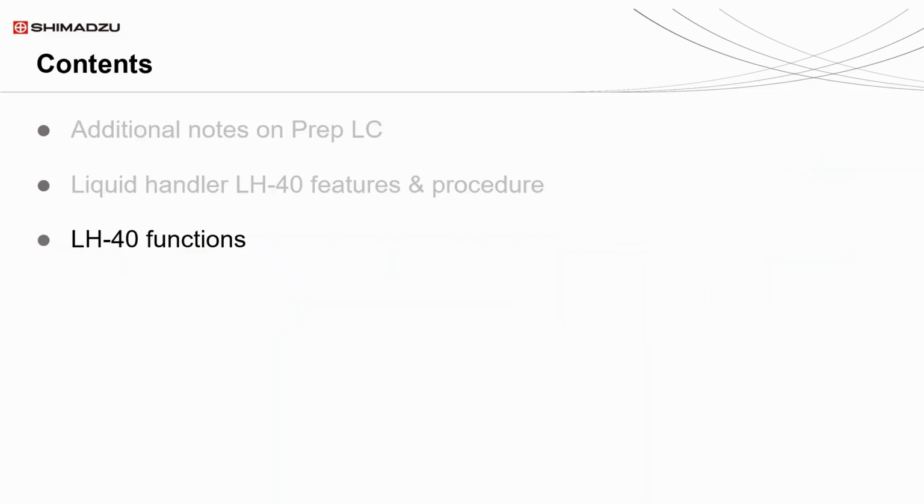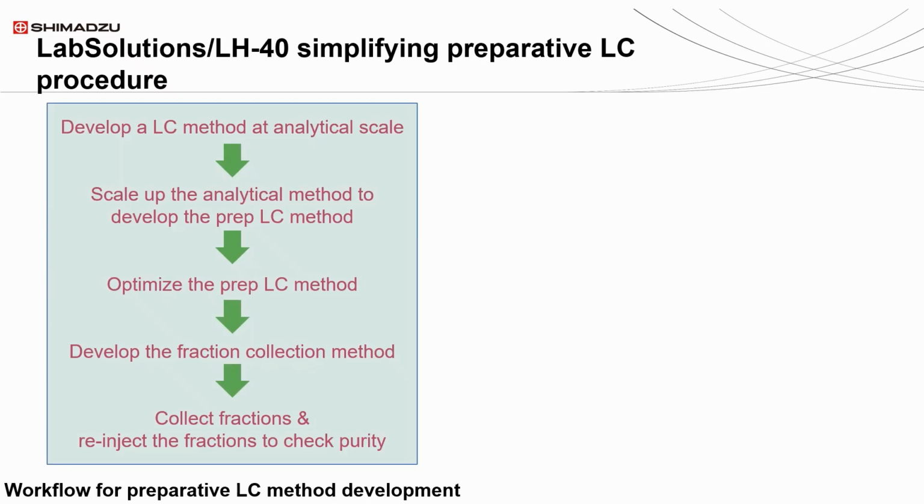Next, we will discuss the workflow to develop an LH40 preparative method. The general workflow of the scale-up of analytical to preparative methods is the same, but the additional step of purity checks is included when using the LH40.